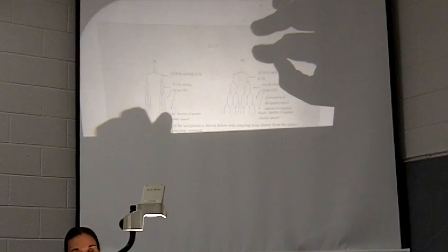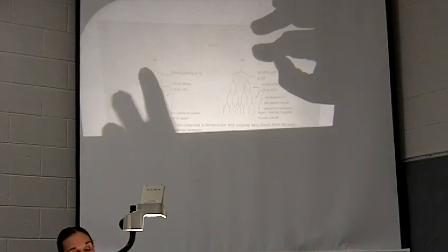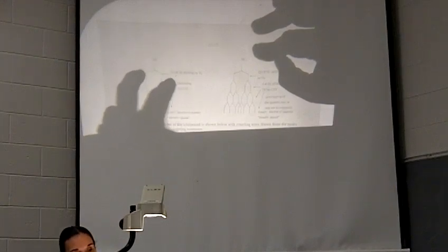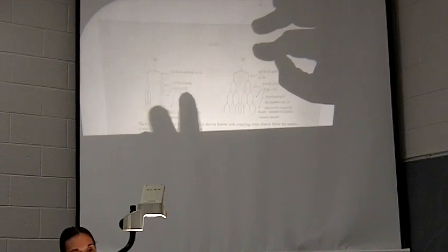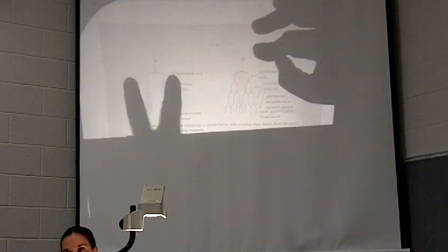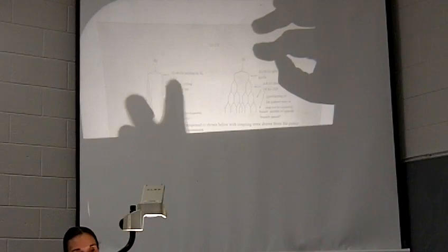1, 2, 3. So in the end, what you're proposing is you're going to have a doublet of quartets, due to the proton that was trans from HA and then the relationship of the methyl group. This is really big relative to what's happening from the protons of the methyl group. Do you see that? We have that big coupling from trans, and then we go down to really small because it's an allylic relationship of HA to that methyl group. Good with that?